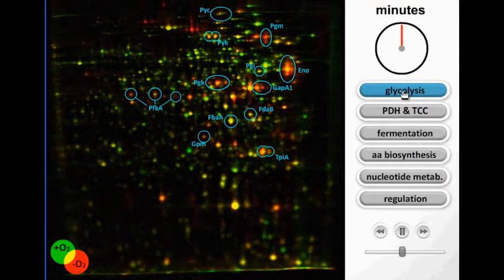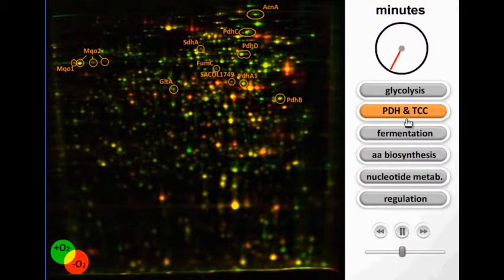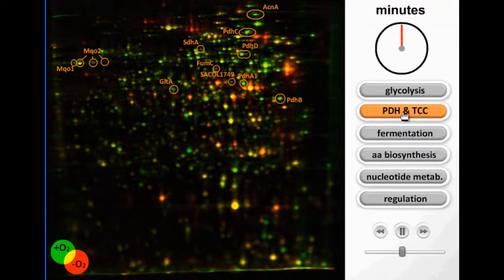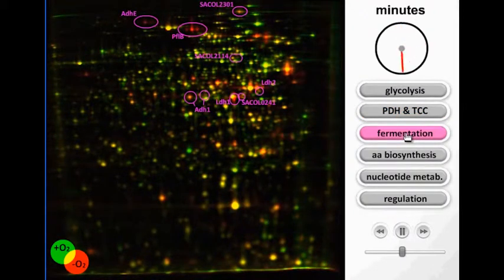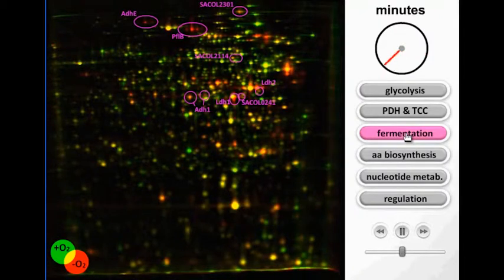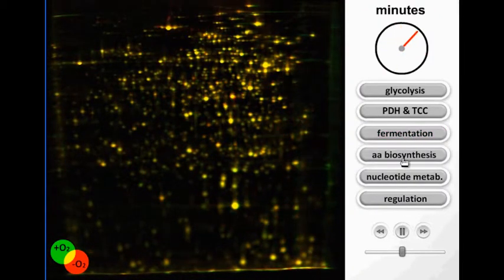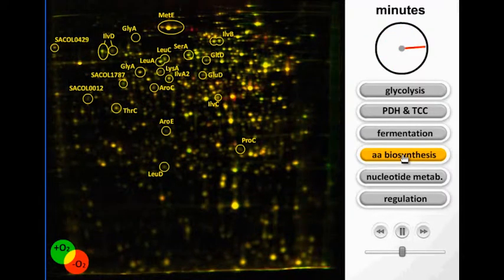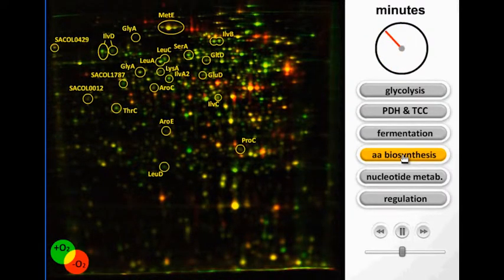Quantization of changing protein amounts between different samples are analyzed and visualized by dual-channel imaging. The protein gel images are therefore artificially colored by computer software. In a process called image warping, spot positions on different gel images are synchronized. Changes in the spot volume now form the basis for quantitative and statistical analysis.